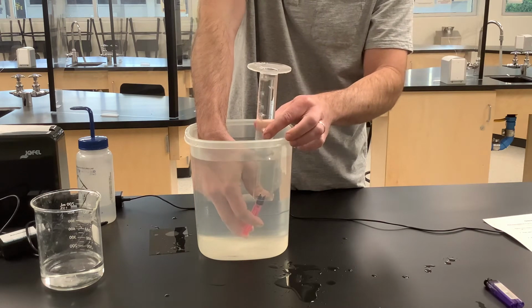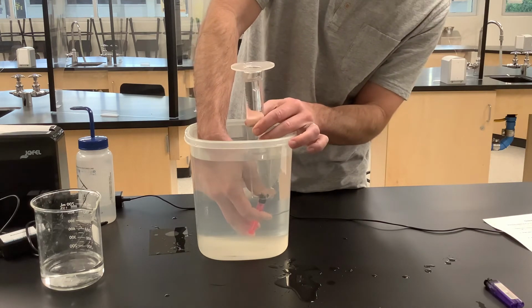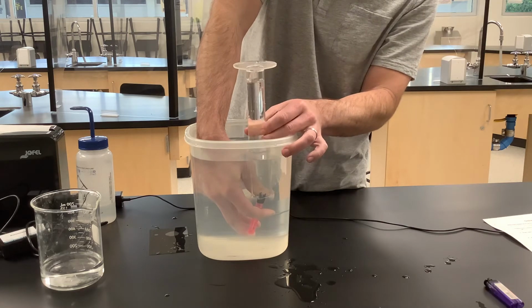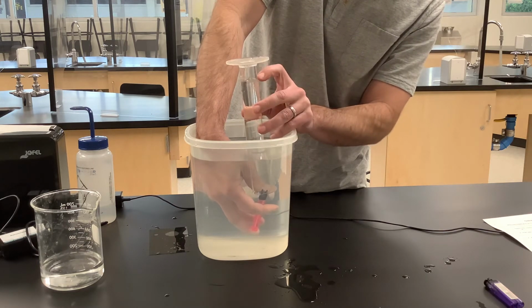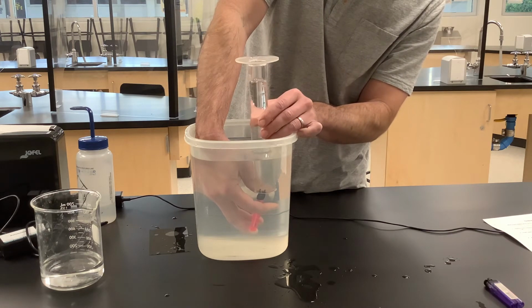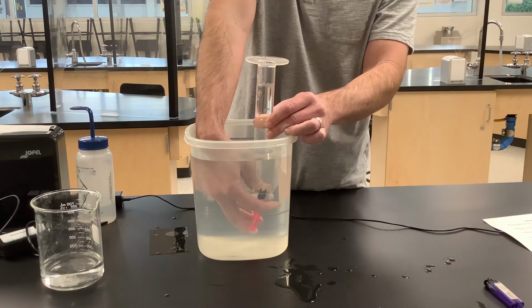There we go. That's better. So as we collect this, we see that the gas is starting to get a nice pocket up here. And we're going to keep going. We're going to collect a pretty large volume, and we can measure the exact volume since this is a graduated cylinder.